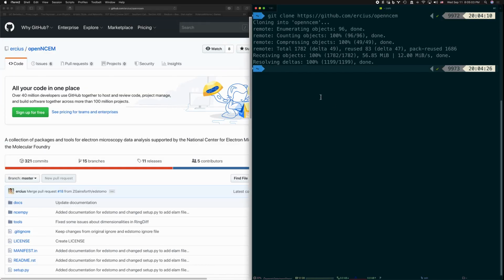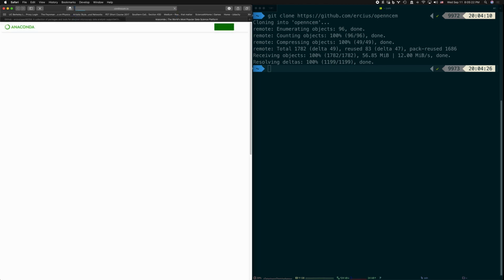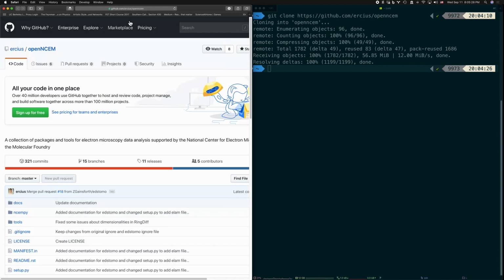All right, the next thing we're going to need to do, I'm going to make a fresh install of Python so that you can see everything that you need to do to set it up. In this case, I'm using Anaconda, which you can also use a virtual environment if you wish. Anaconda is from Continuum.io. It's a Python framework. So the advantage of Anaconda is just it's very handy.